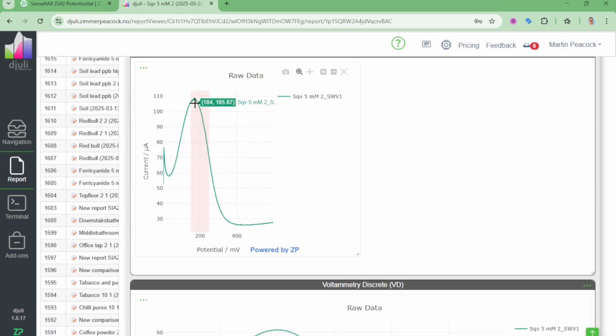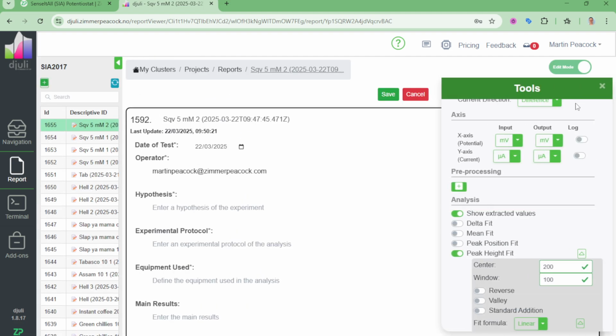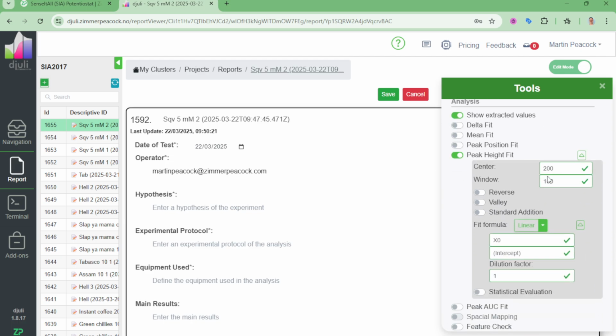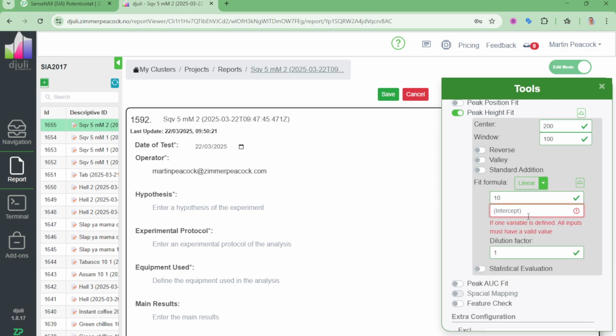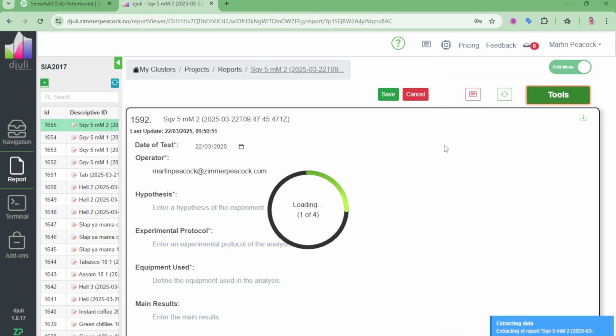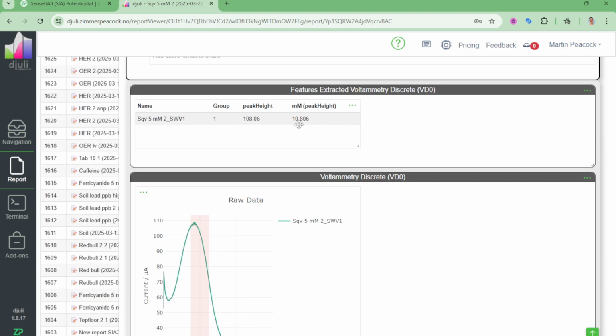So there we are. I found the peak height here, but at the moment I don't have the concentration. But let me just show you something really cool, because it allows you to go from the idea of peak height to an actual concentration really quickly. So I'll just put in 10 here, and I'll put in 0 here. This is like trying to fit a linear equation with a gradient of approximately 1/10 with an intercept of 0. Let's have a quick look what that looks like. And let me come down, and yeah, so in fact it says at the moment that's 10 millimolar.